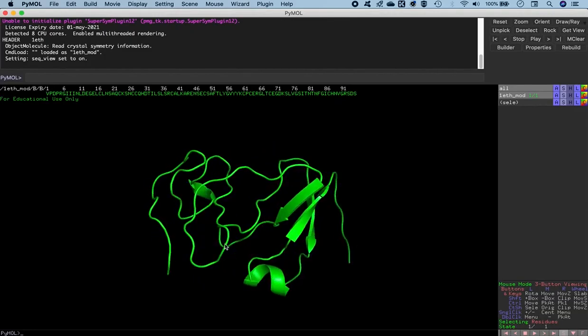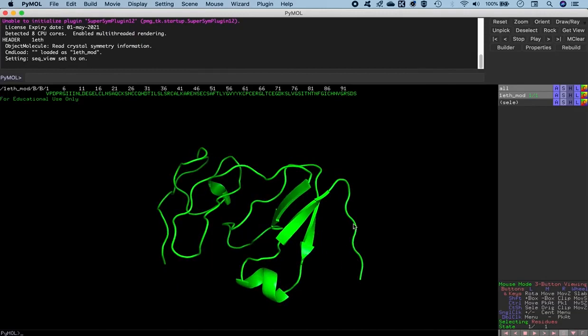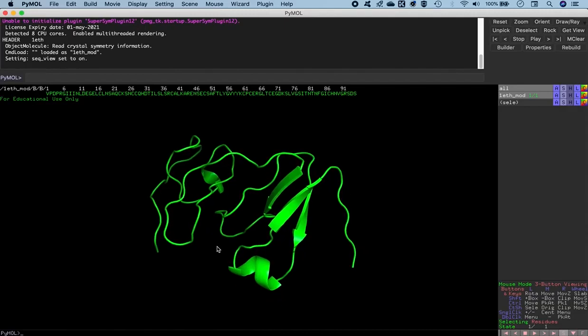Well, just by looking at the structure, you can see that they are kind of far apart from the other loop regions or the other structure formed regions. But we just want to be sure, we just want to be as perfect as possible. So we'll do a loop refinement. Now, the loop refinement could be done by using the feature of Modeler, which is also another program which does some homology modeling. And we select these loop regions separately in the Modeler interface, and we ask it to refine the loop regions to pose it in its most energetically favorable conformation.